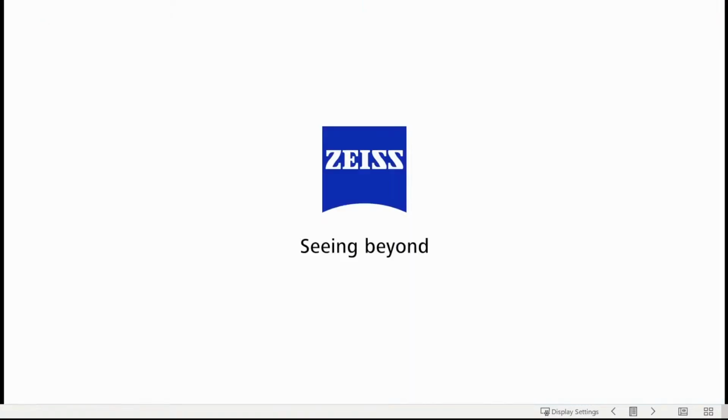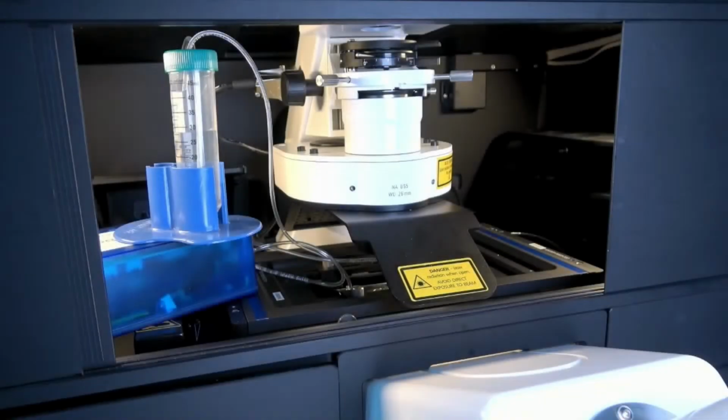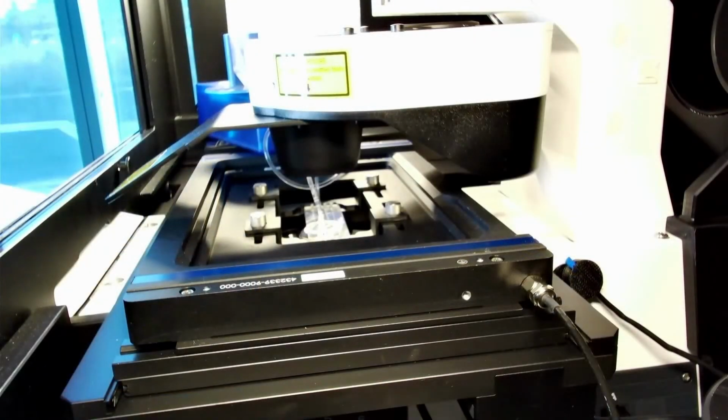So why don't we go on and hop over to the software, and I'm going to actually show you how we can do this in a microfluidic chip. As you can see, we have a microfluidic chip set up on our LSM 900 with Airyscan right now, and I have a flow of fluorescent rhodamine currently going through that, so that's going to be our fluorescent dye of choice that we're going to use to validate our flow measurements in this chip.